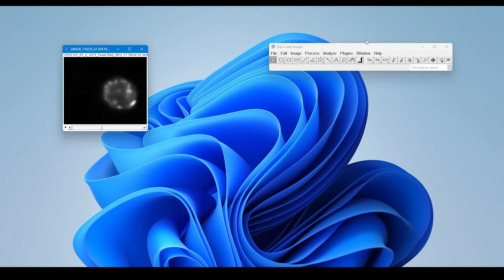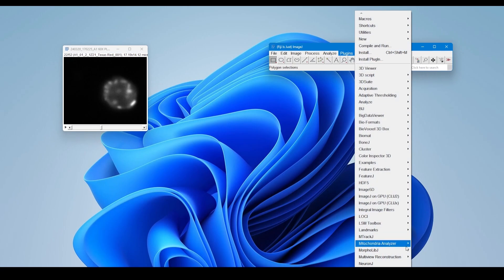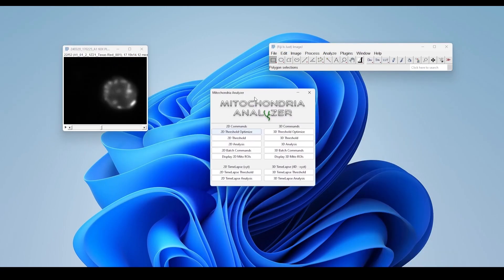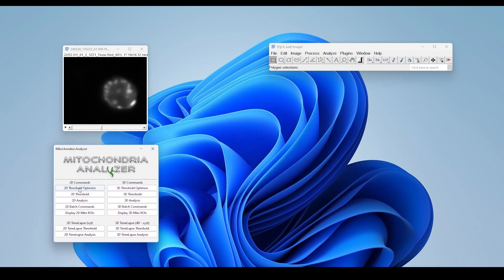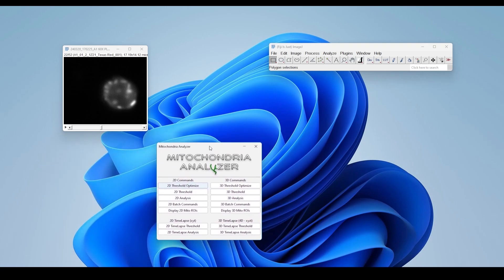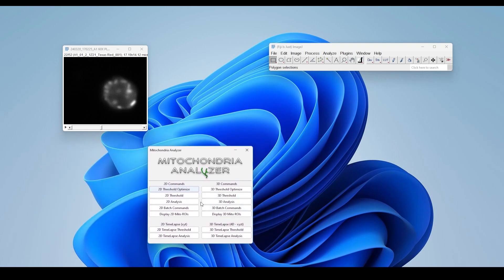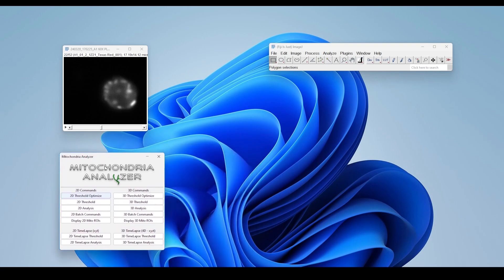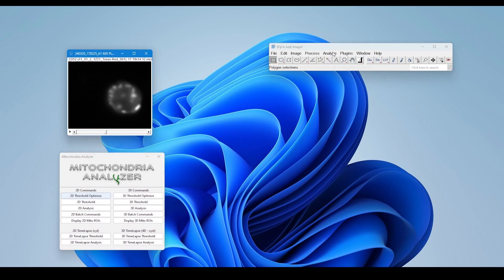So let's go ahead and open up the mitochondria analyzer — it is a plugin for ImageJ. I will put the link to the GitHub page for this plugin and you guys will be able to download it from there. The instructions are there, there's a very nice user manual. I highly recommend that you read it. But in this tutorial, I'm just going to go through the steps that I utilize myself to analyze the Z-stacks of mitochondria shown here.